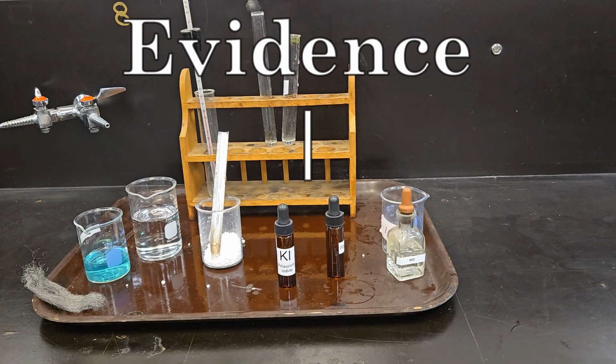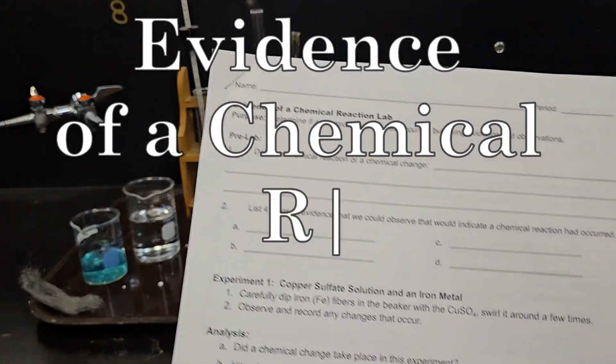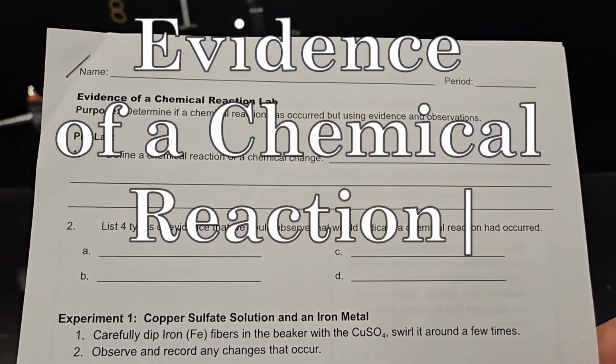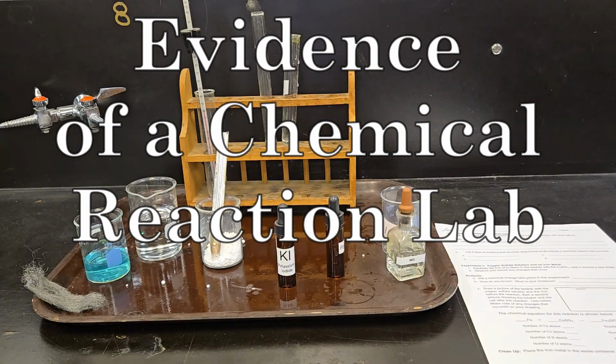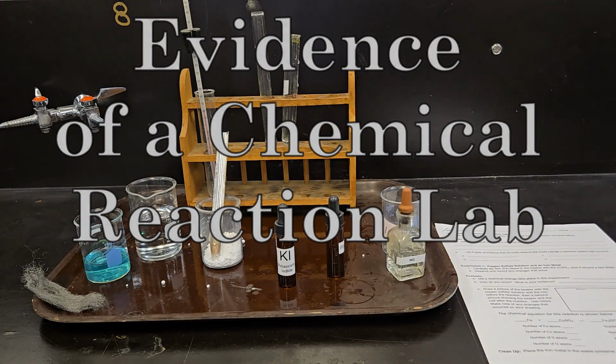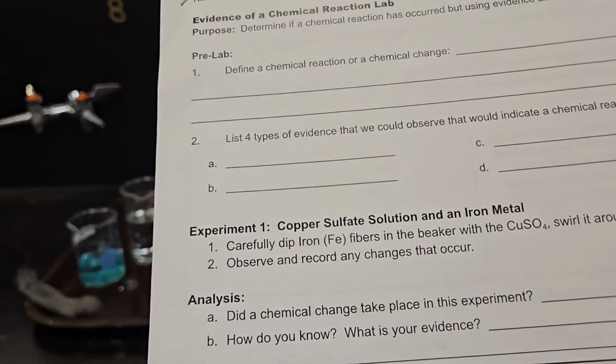This is the makeup video for the evidence of a chemical reaction lab. You'll need this paper to complete this lab. If you don't have this paper right now, get it before you continue this video. I'm going to try to do this video in less than 10 minutes. It's pretty straightforward. On the evidence of a chemical reaction lab, there are 4 experiments. I'll go through each one.